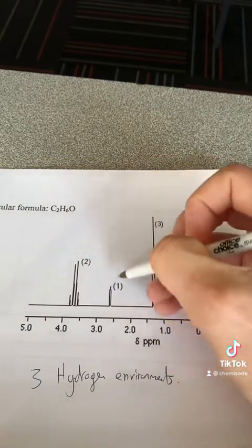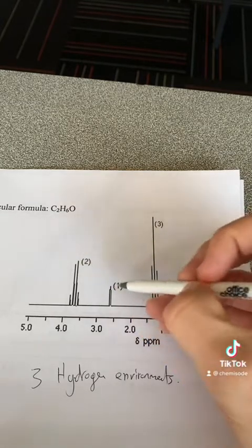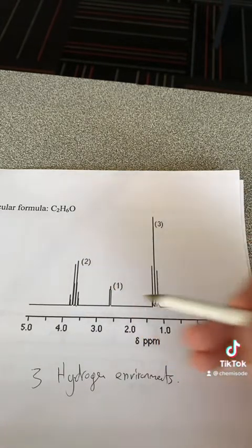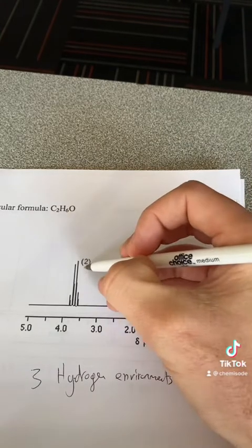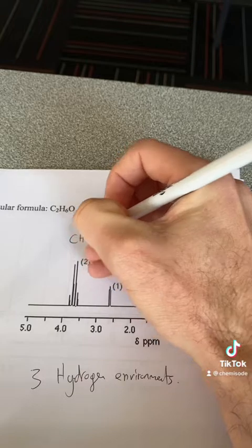First things first, I've got these numbers here which tell me about the size of the peak, or the integration. This tells me about how many hydrogens are in this particular environment. In this one, there are 2 hydrogens in the environment. What that generally means is it will probably be a CH2.